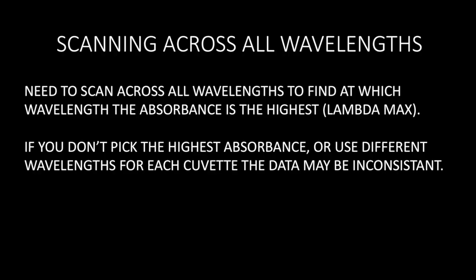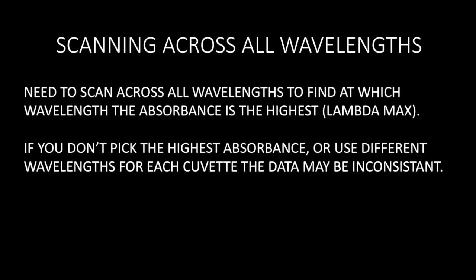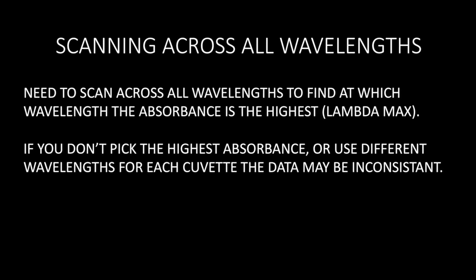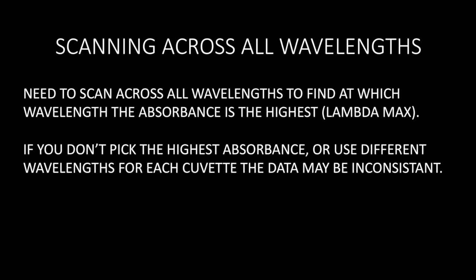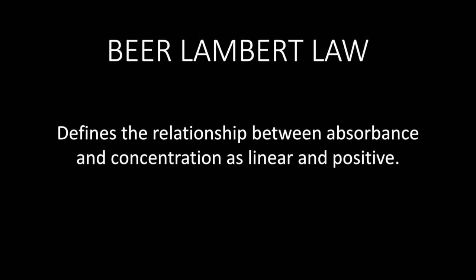When you first use your spectrophotometer, you need to scan across all visible wavelengths. You scan across all wavelengths in order to find the best possible single wavelength to scan across for your dilutions. That wavelength is the wavelength with the highest absorbance on your initial scan and is known as the lambda max. If you don't pick the highest absorbance or you use a different wavelength for each cuvette of dilution, the data could be inconsistent.